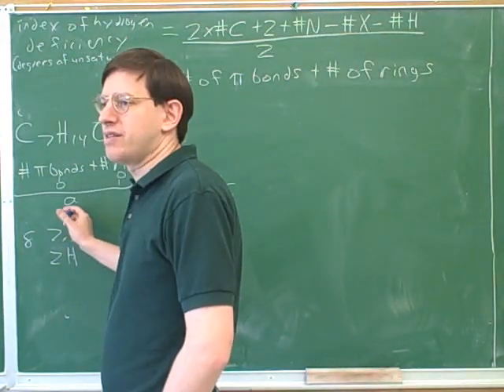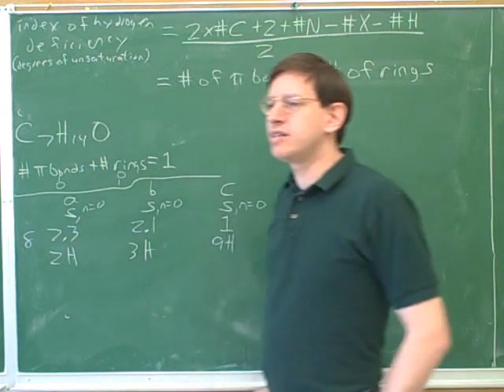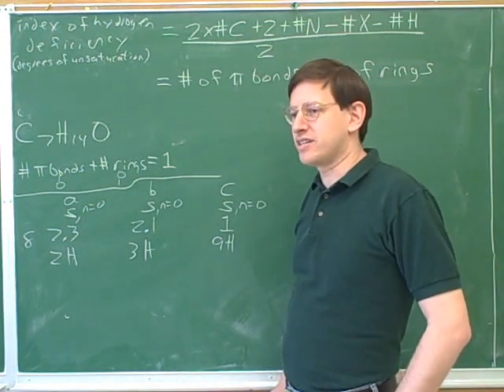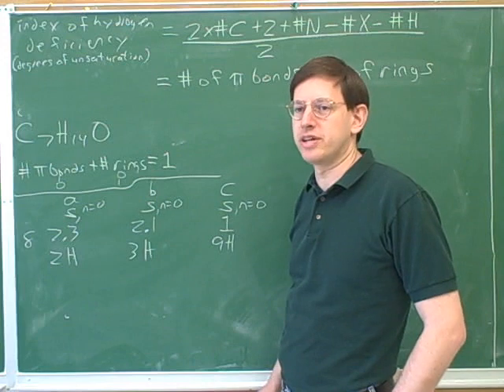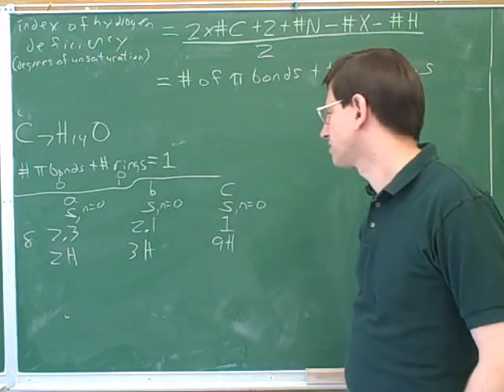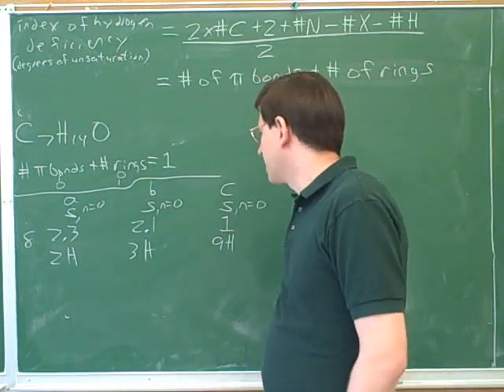What would N be for group A then? 0. This is interesting information. It seems that none of the groups of hydrogens are adjacent to other hydrogens. That should strike us as kind of weird. How can we find enough room in the molecule to make sure everyone's not adjacent to each other? Hopefully that'll be a useful clue to us. It's unusual to get all singlets. Let's see if there's any other clues that we can get here.